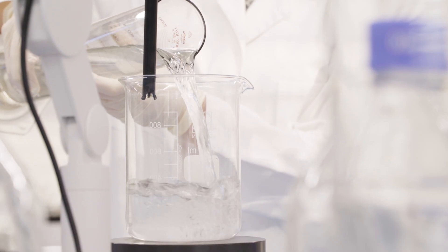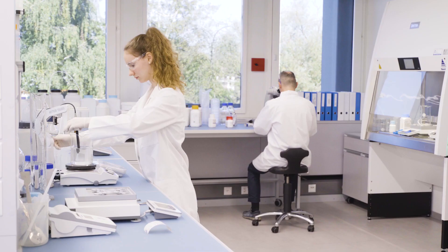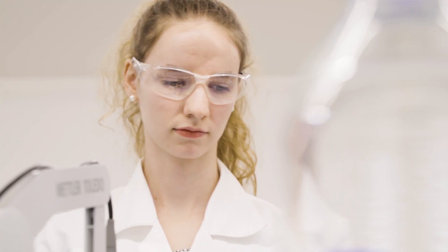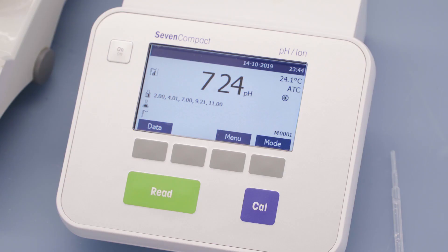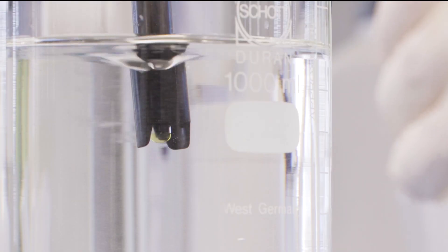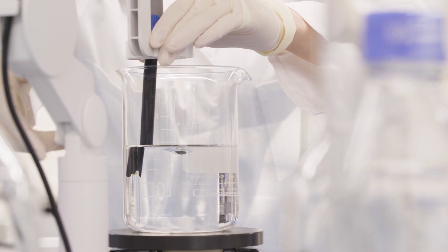The ingredients are then dissolved thoroughly in the solvent. The pH of the buffer is measured and adjusted if necessary. Finally, the buffer is topped up to the required volume.